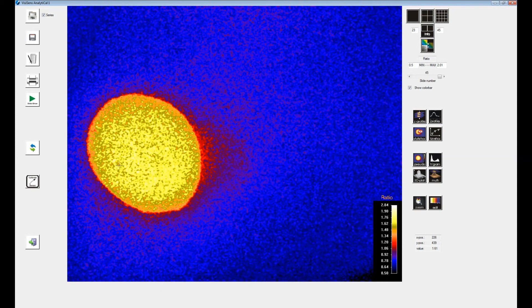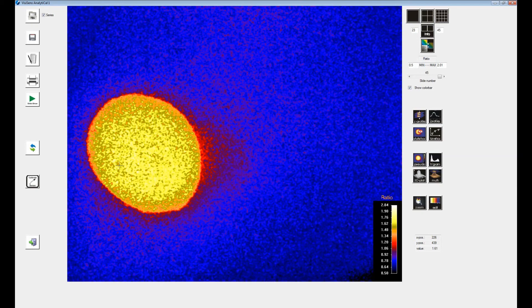To get oxygen values and percent air saturation, you will have to perform a calibration. You can see how to perform a calibration in our calibration video.